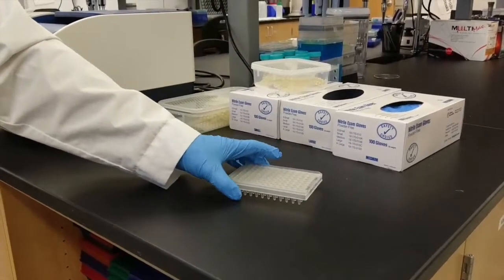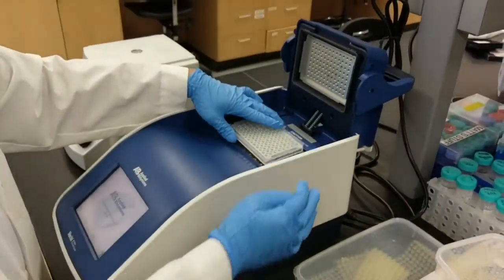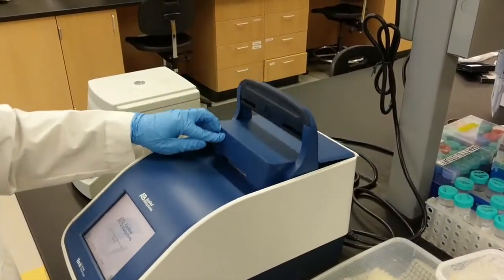Now that we have high quality and high yield DNA, it is time for us to fragment the DNA into smaller pieces for Illumina sequencing and begin library prep.